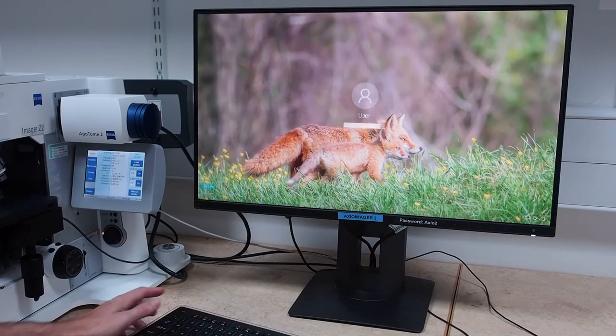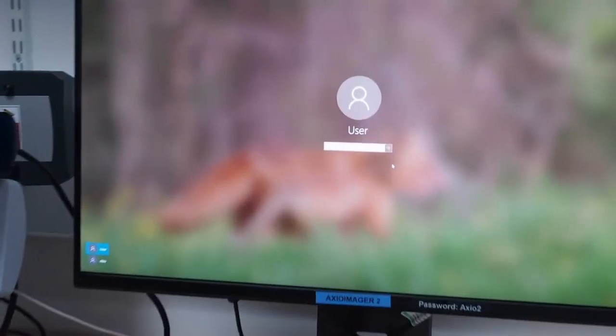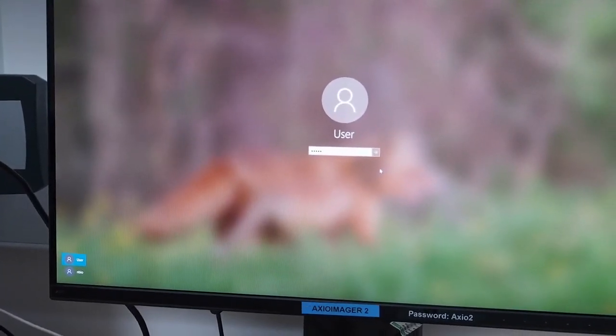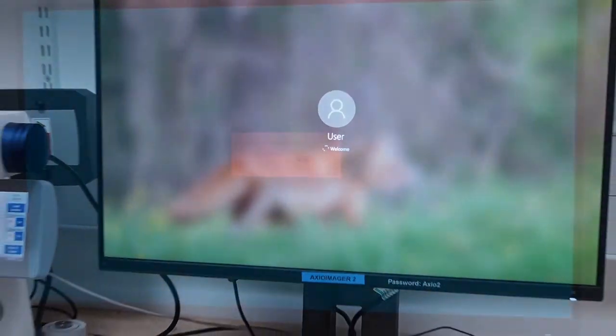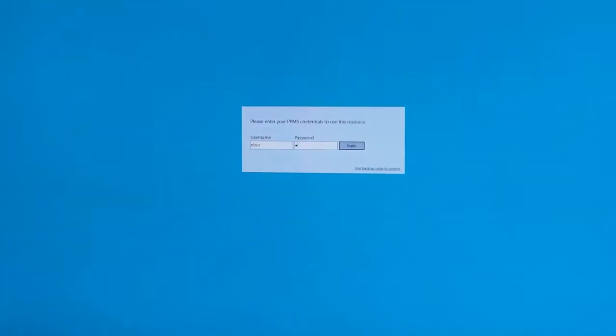Next, log in to the locally managed acquisition PC using the provided username and password. Then connect to your PPMS booking account to log your usage.